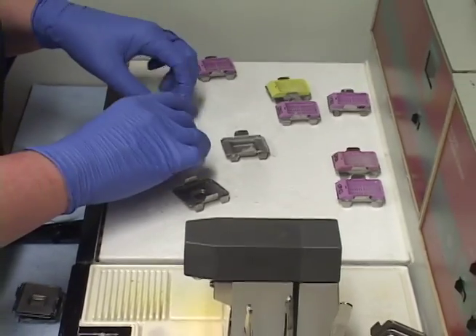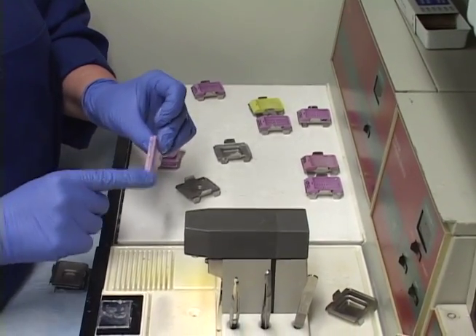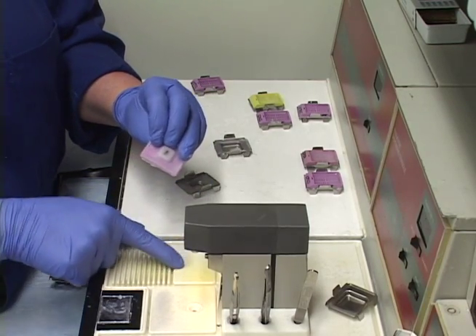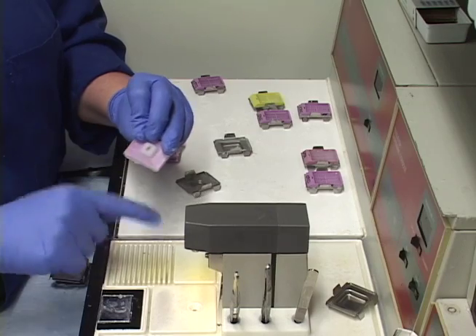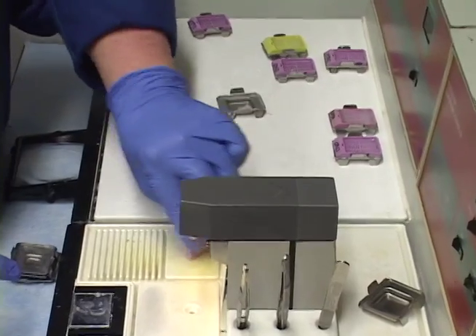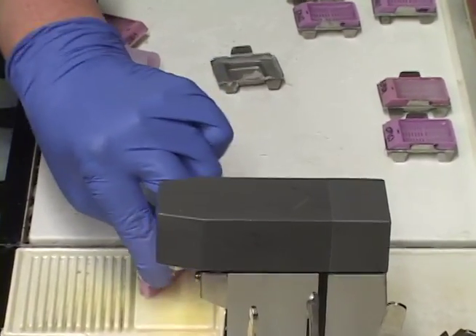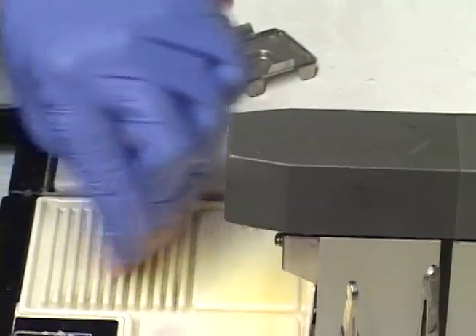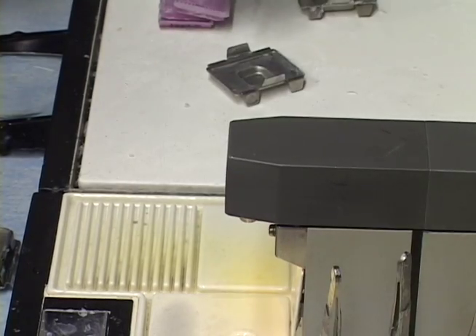You can see there's paraffin on the edges of the blocks. I scrape those off — just be careful not to touch anything to the hot pipe. I actually use a dull knife for scraping, which is a little bit faster.